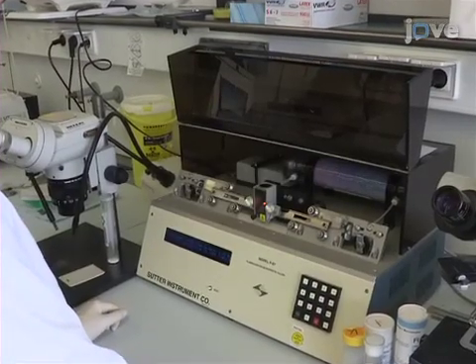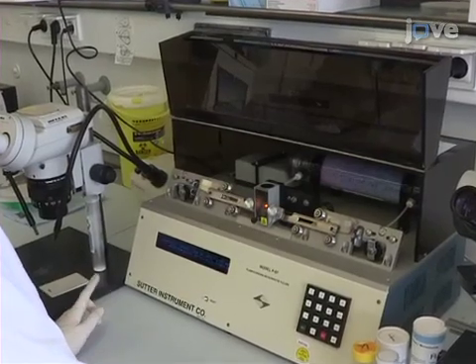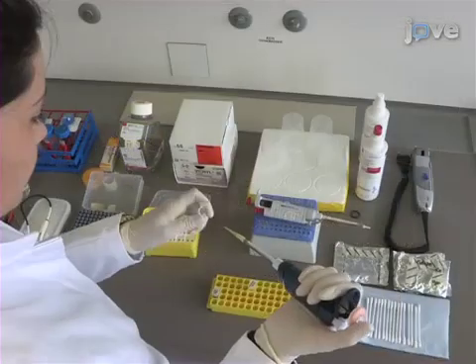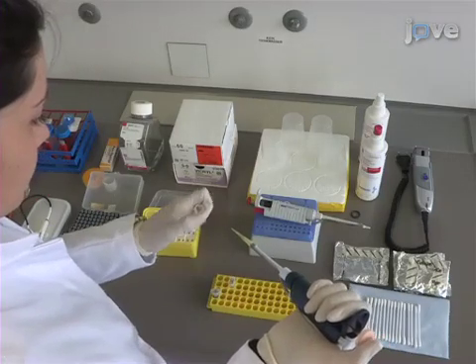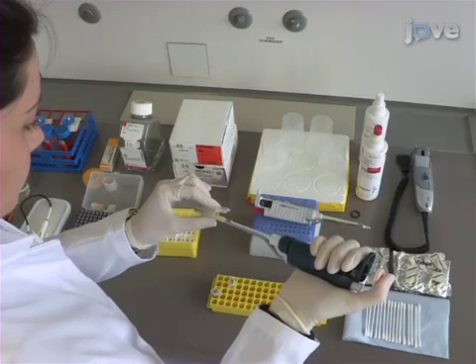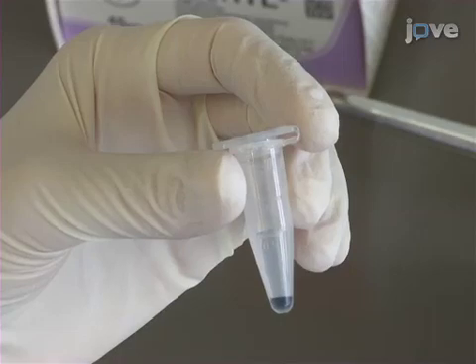Begin this procedure by pulling some good quality glass micropipettes, as they are essential to reduce the initial high abortion rate due to loss of amniotic fluid. To prepare DNA, dissolve the purified endotoxin-free plasmid DNA in PBS containing 0.1% fast green to a final concentration of 1–2 micrograms per microliter. The fast green will make the injected solution visible in the embryonic brain ventricle.